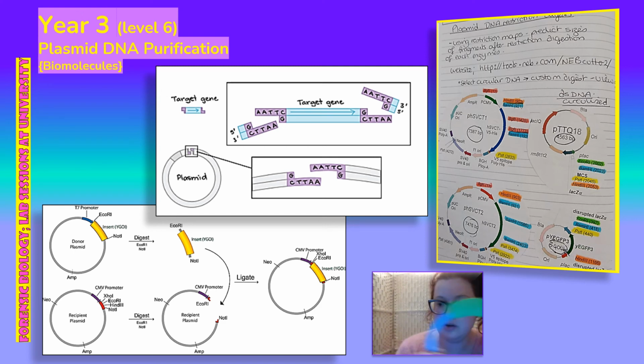For example, I've got a makeshift plasmid here with foam, and you would take certain pieces out of the different parts. If you can see, you've got different colours. Hopefully that's coming up there. It's actually pink, but it's not coming up. You've got pink, purple and blue. It would have different sections, and it would actually cut pieces out, and then you could insert pieces in.